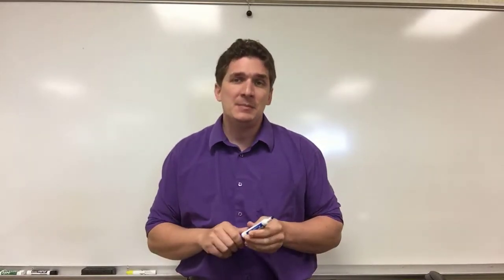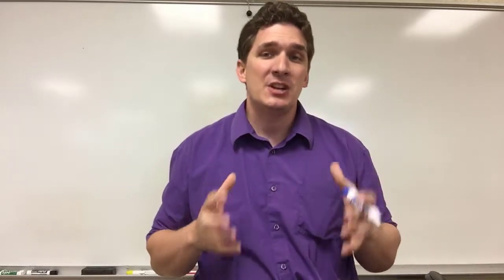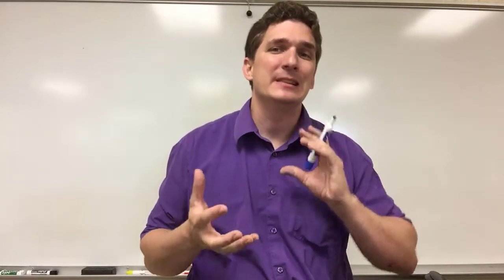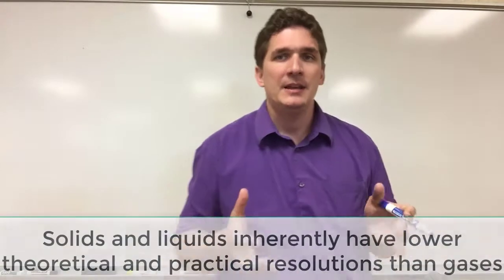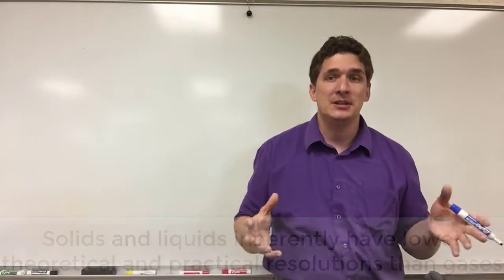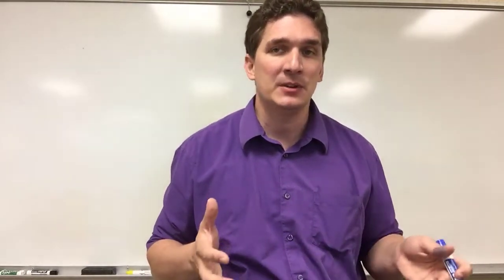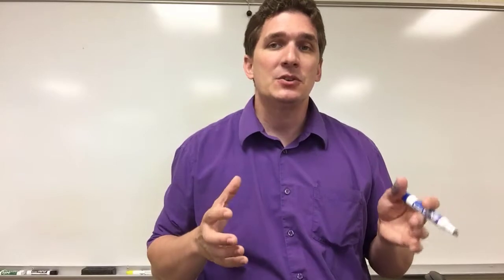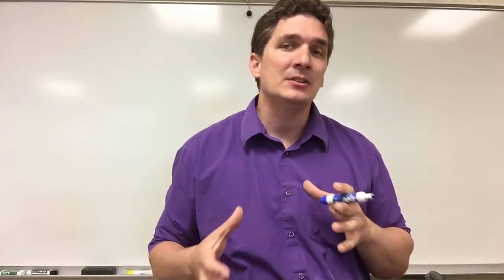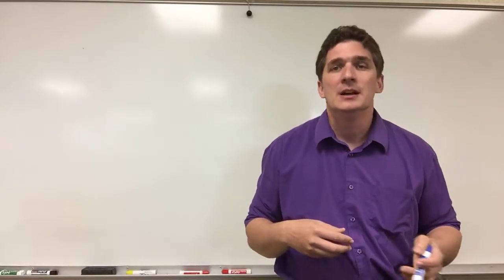Now, the other thing to keep in mind with IR, if we're working with solid versus gas phase, the solid is going to have lower resolution. And this is kind of a thing that gets lost in the details. If you're working with gas phase, there's a lot of information. Solids behave a little bit differently in terms of how they interact with the infrared beam. So when we work with solids, we're typically not looking at such high resolutions as we would with the gas phase. But again, we'll talk about more of this with the theory.